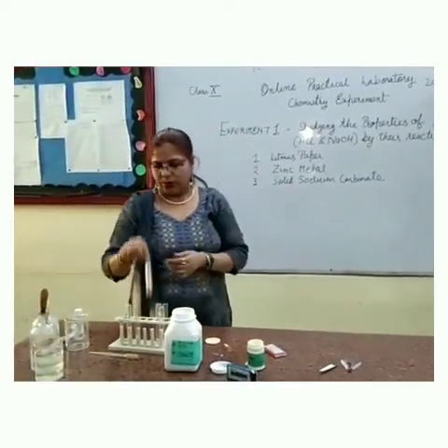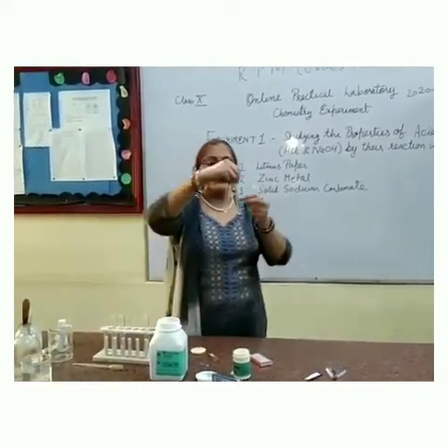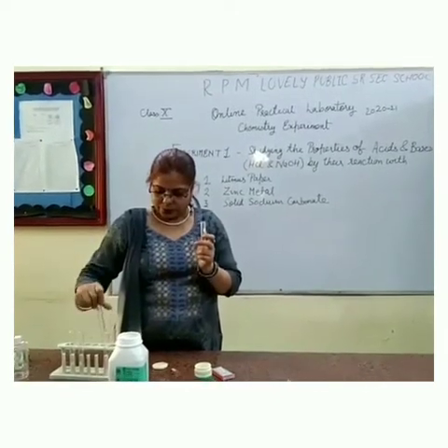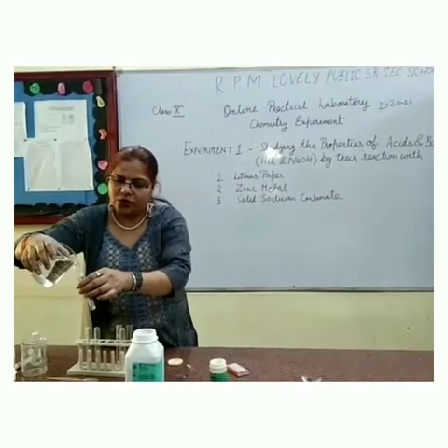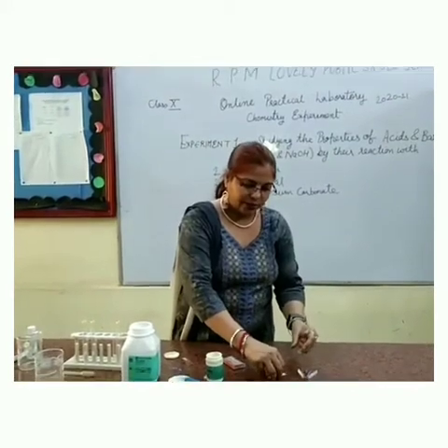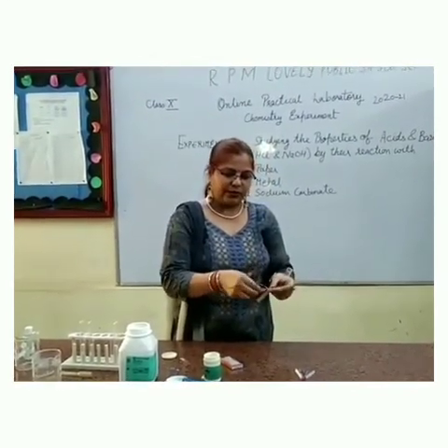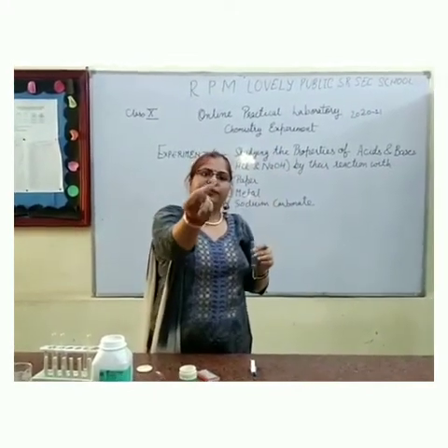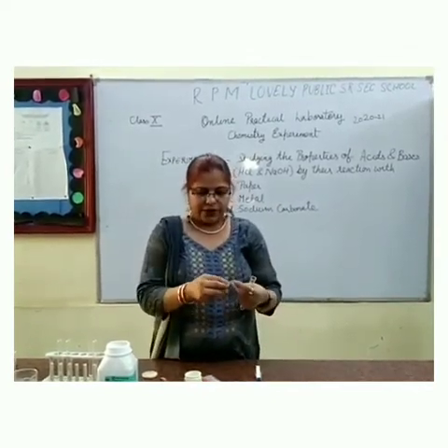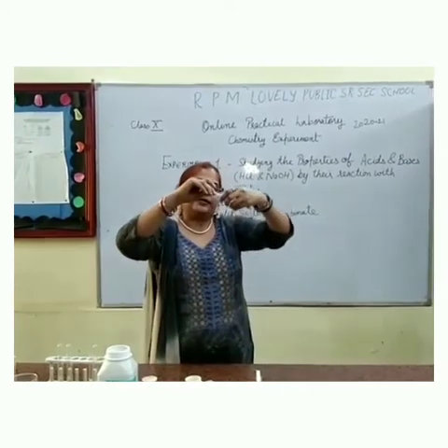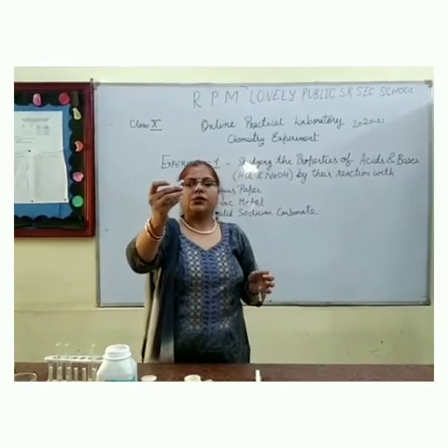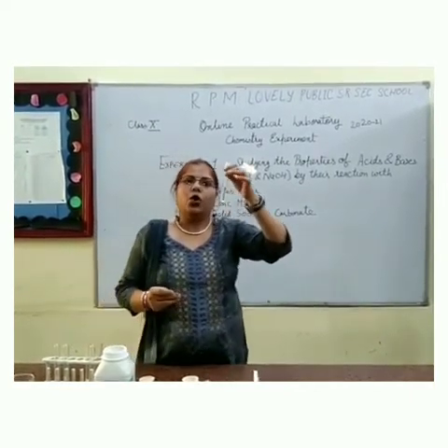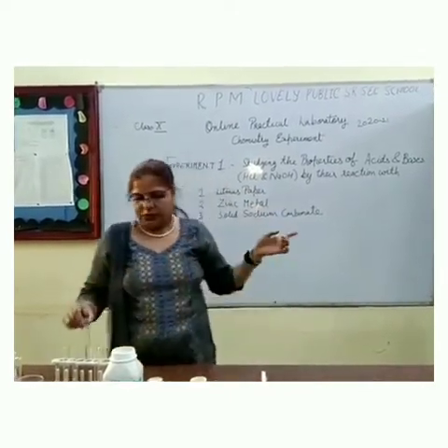Now we will take a third test tube. This shows that acids turn blue litmus red and bases turn red litmus blue. Now let's see what is their impact on water. We are taking water in the test tube, and again we perform both the red litmus and blue litmus tests with this water to see if any change occurs. We can see that when we dip the red litmus in water, there is no change. When we add the blue litmus in water, there is also no change of colour. So that means this water is neutral — neutral solutions do not show any change with red or blue litmus paper. This was the first test which we have done.